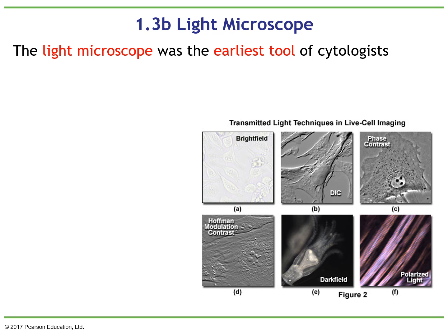There are different types of microscopy. The first one that we are going to study here is light microscopy. That is the first one that cytologists used as a tool. Right now we have different types of microscopy, and here you can see a picture. And I want you to take notes.